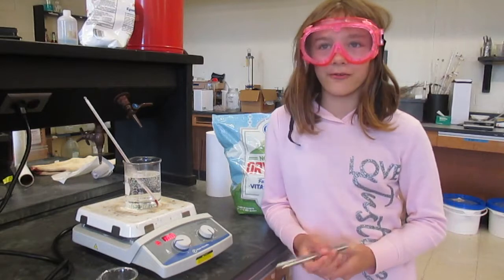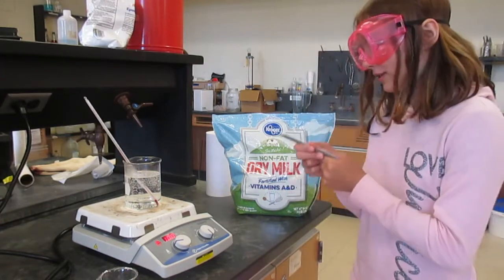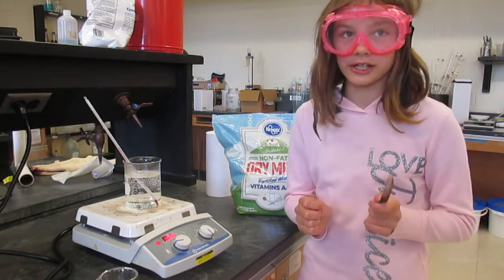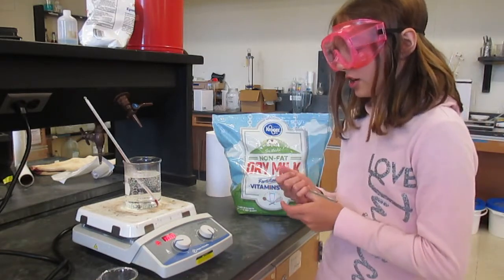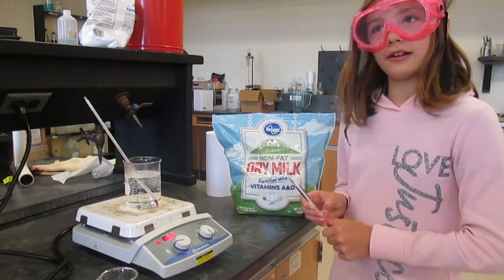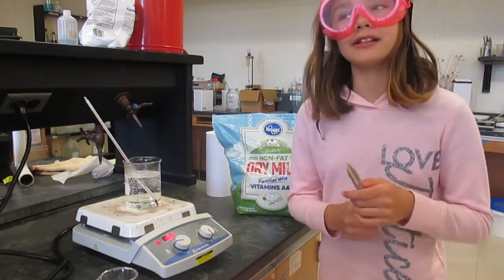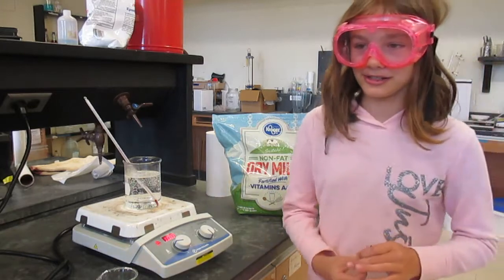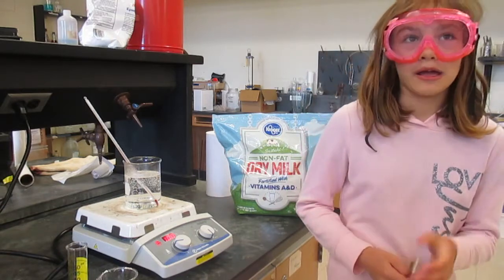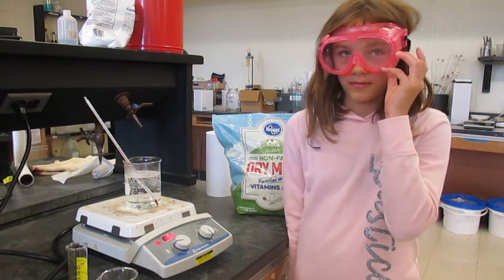Once you have weighed out your 5 grams of non-fat dry milk, you will want to dissolve it in 20 milliliters of warm water. It can be no warmer than 55 degrees Celsius. Our water is 50 degrees Celsius. So how much water are you going to add again? 20 milliliters. And are you going to use a graduated cylinder to measure out the 20 milliliters? Yes. All right. So the next step is we want to measure out 20 milliliters of warm water, right? Mm-hmm.